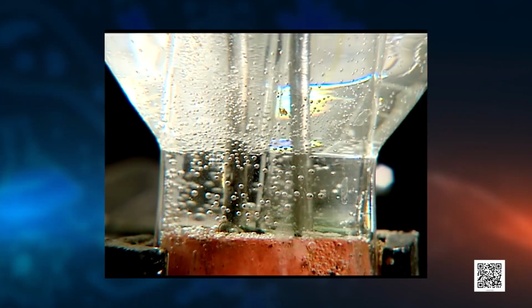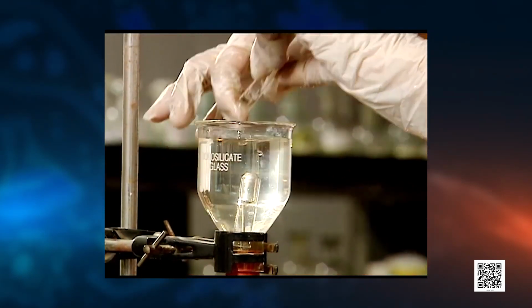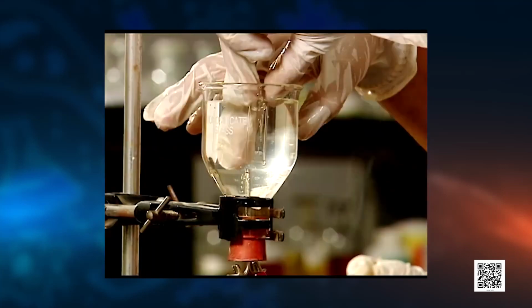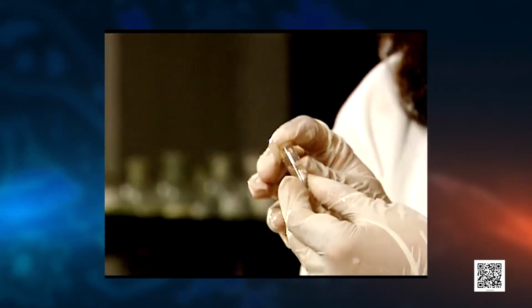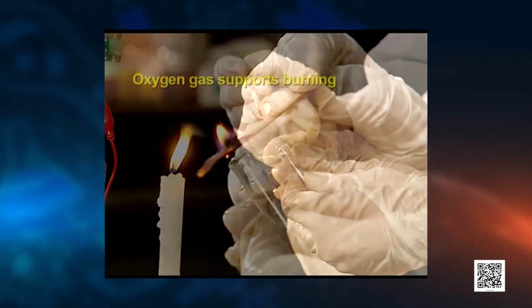We will remove the test tubes carefully and safely. If we remove the finger from the mouth of the test tube, the gas will escape. Where we get a pop sound by placing a burning splinter, it means the gas is hydrogen. Oxygen helps in burning. You all know this from your experience. So look here, bringing a burning splinter near the mouth of the other test tube, it is supporting burning. See, the flame is becoming brighter. Have a look at the balanced chemical equation of decomposition of water. Here, what do you see on screen?